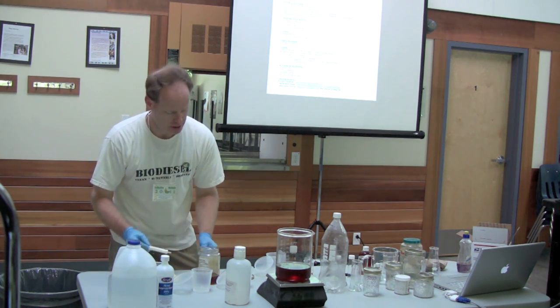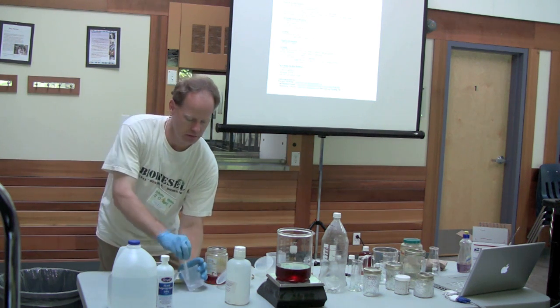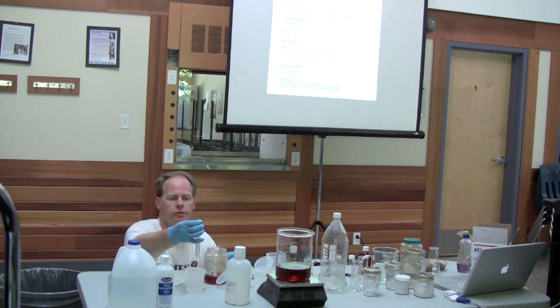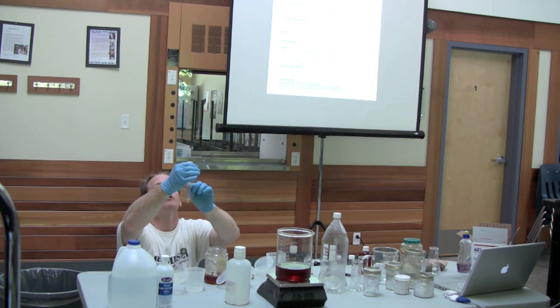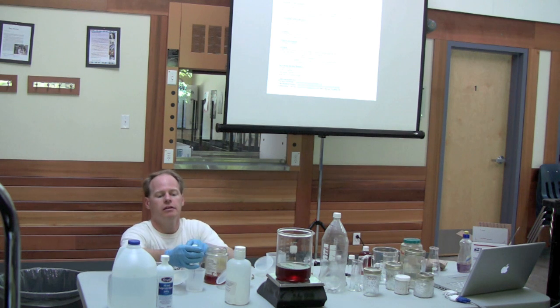So the basic recipe, again, is 10 milliliters of isopropyl alcohol. A tip when you're using syringes is you can always get a bubble on the top. The bubble is a lot easier to use to find your mark on the syringe than the top of the syringe, because sometimes they're convex and it makes a mess.